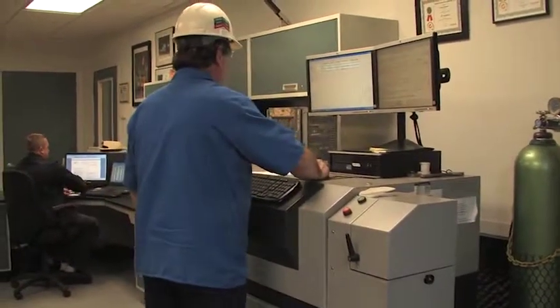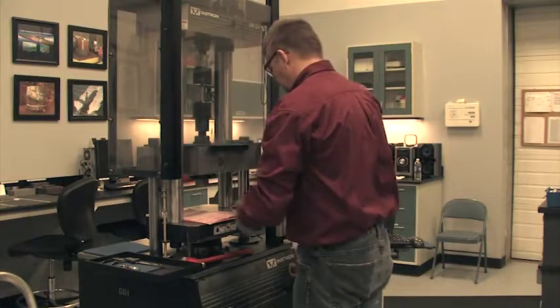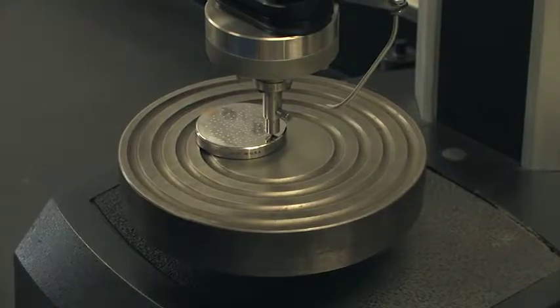We perform several common metallurgical tests in-house such as tensile tests, fatigue, hardness, dynamic tear, product analysis, grain size, microcleanliness, microstructure, corrosion, and response to heat treatment.